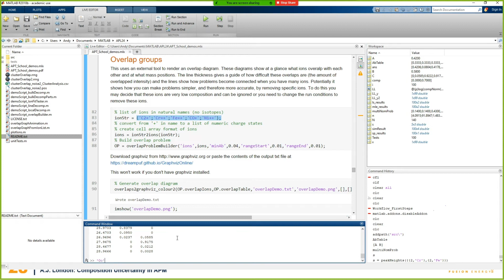If you want to define a new element which has a mass position 18 and 100% abundancy, then you can do that, and that's kind of defining a specific isotope. And then as long as your range files and everything else uses that element, you could write whatever you want there. You could have like X, Y, or whatever you want. You can define whatever elements you want. So it's all customizable. But it doesn't handle specific isotopes.